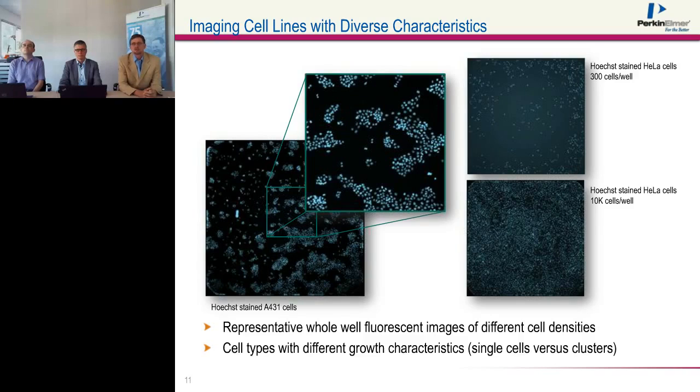You can see that the HeLa cells grow quite alone, so they are well spread out over the whole plate, while the A431 cells are growing in patches. Both can easily be evaluated and segmented by our algorithm for single cell counting. Please note the bow-shaped cell group in the center of the left image. We will find this again in later images.